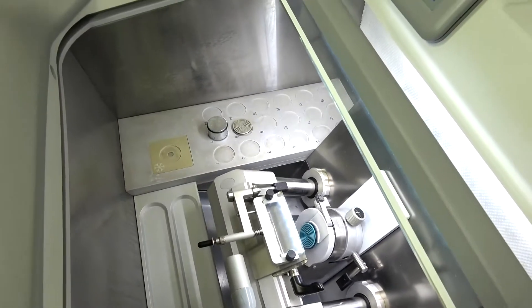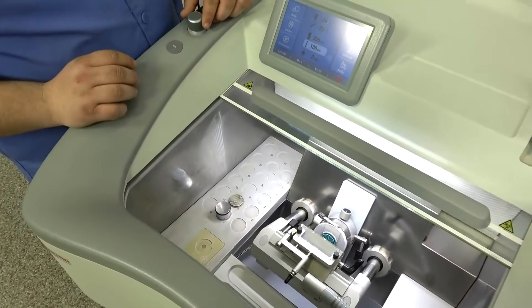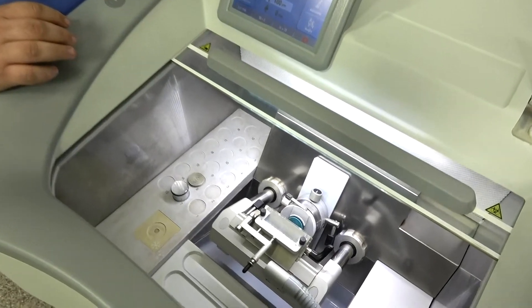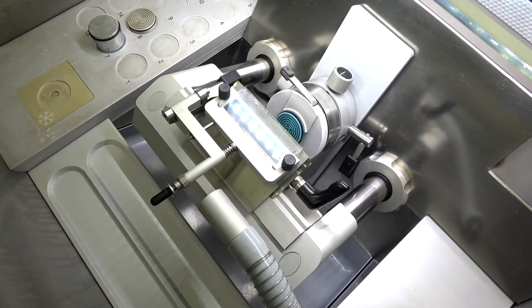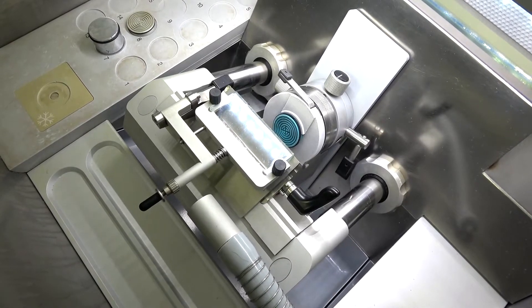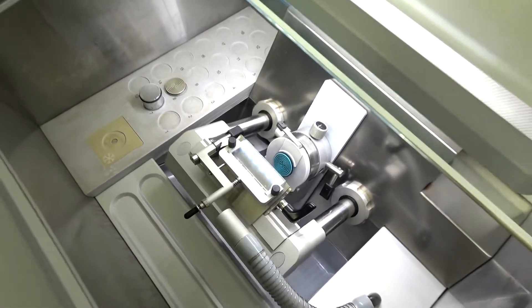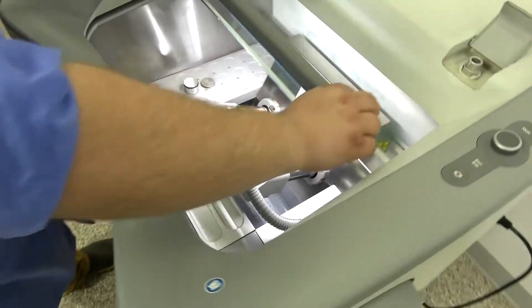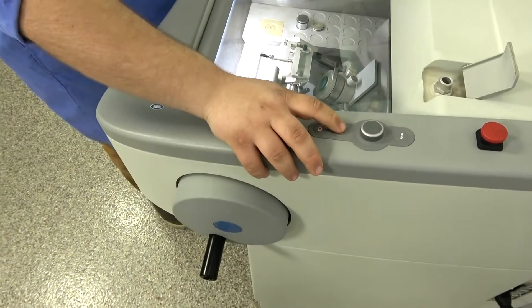This unit is a fully motorized system so you have a motorized advance and retract along with motorized cutting control over here.